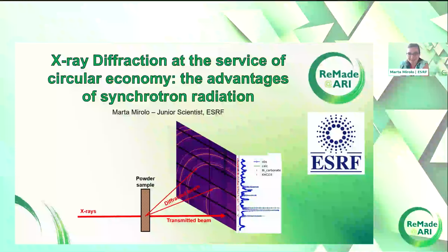I'm a junior scientist and I'm working at the European Synchrotron Radiation Facility in France. And in my presentation today, I would like to focus on why someone would like to go to a synchrotron rather than do a measurement in the laboratory-based X-ray diffractogram. So my focus is X-ray diffraction.